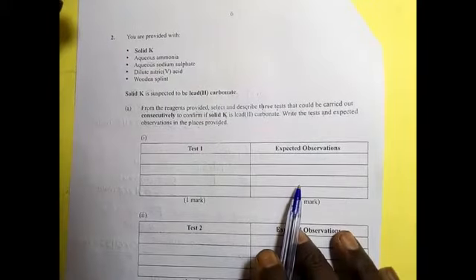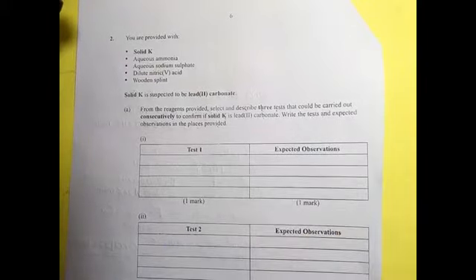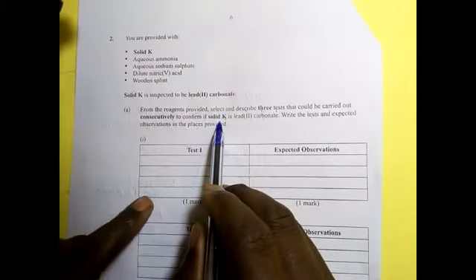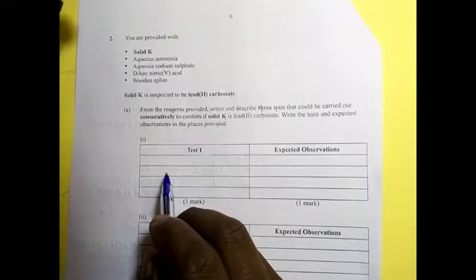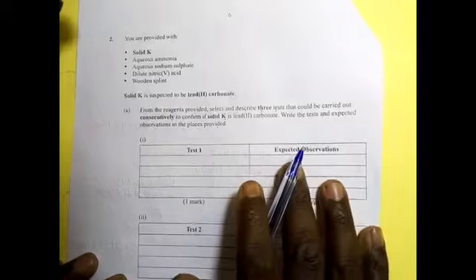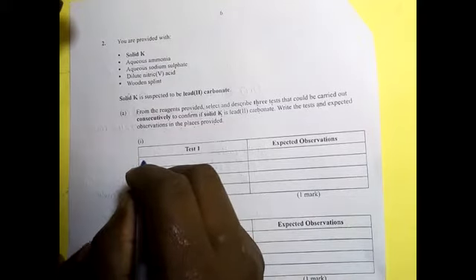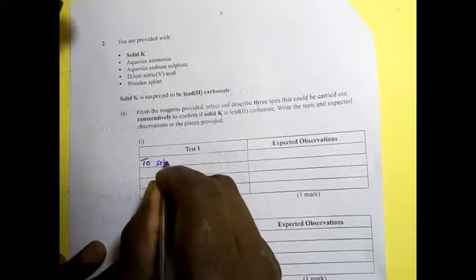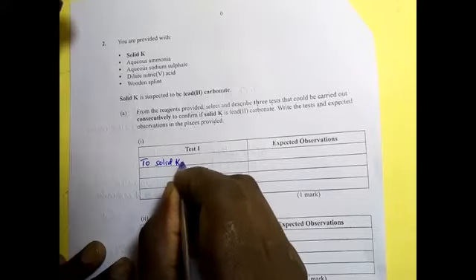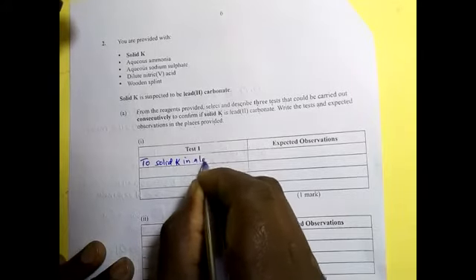So the first thing you want to do is to test whether indeed when you add acid to the solid provided, it will give effervescence. If it produces effervescence, then you are likely to say this one could be the lead carbonate. So the first test: place solid K in a test tube.